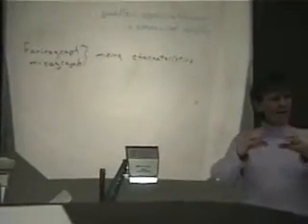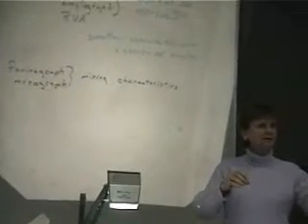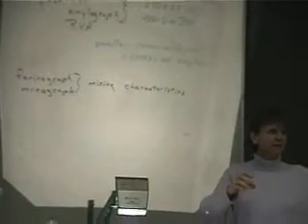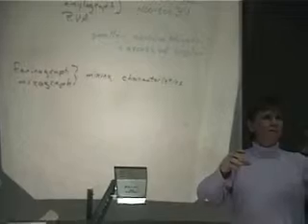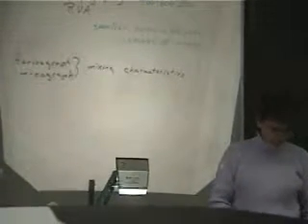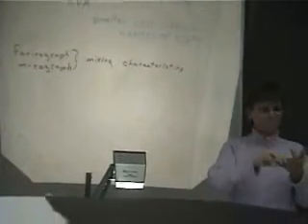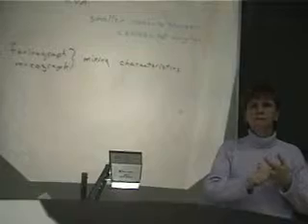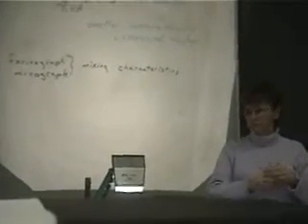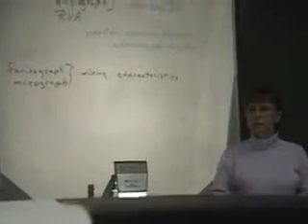So the alveograph and extensograph are looking at after mixing. Farinograph and mixograph are looking at during mixing. So they're different. Absorption, peak time or mix time, and something about strength. All of these tests would be rheological. Functional or rheological tests, yes.